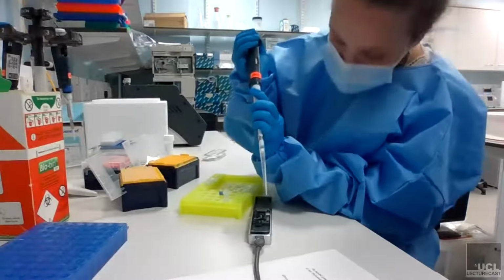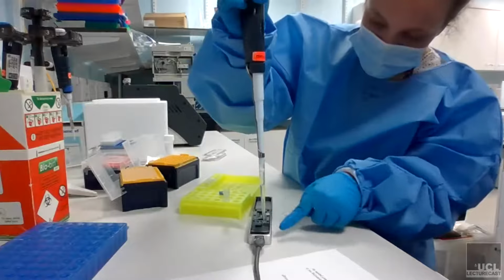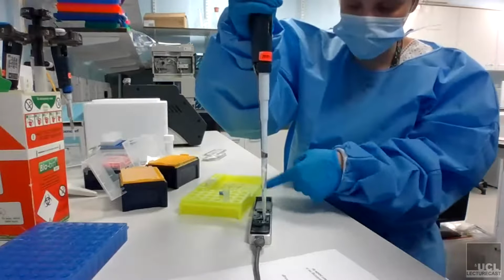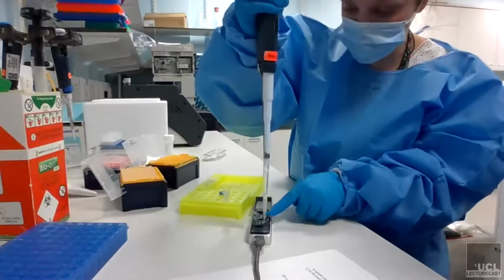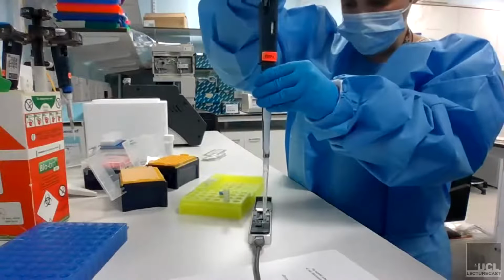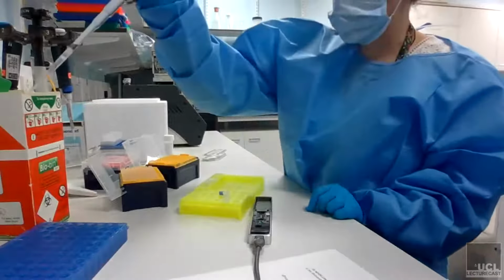Then you need to add the buffer. I tend to make a blob to make sure again that there's no air, and then twist it, and hopefully you'll see the liquid being pushed along. This is an old one, so it was clear, but if this was yellow, you'd see the yellow being pushed along. And in fact, you can see it all there, look. That's the old run that we did from earlier. You can see that I'm just pushing liquid across, and you can see it all moving through. That's the waste port where the old buffer goes. Then I leave it with a little bit in, just to make sure I'm not introducing any air.